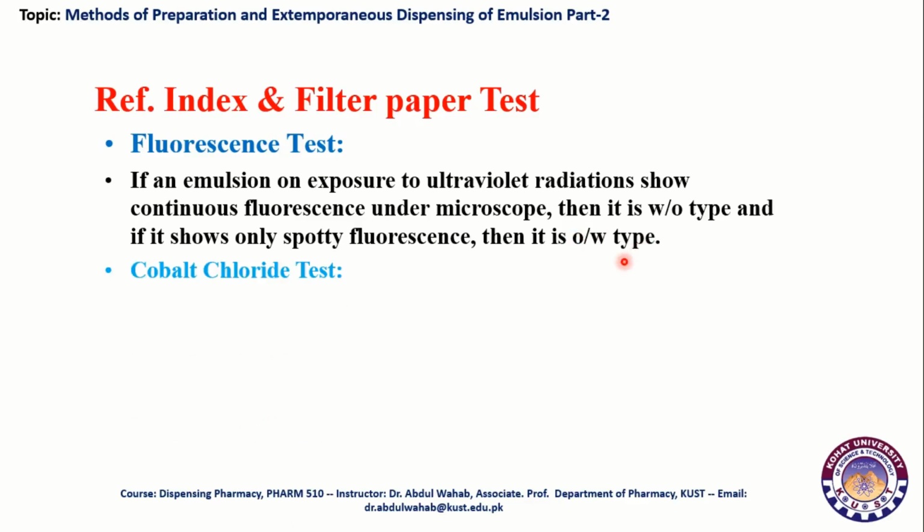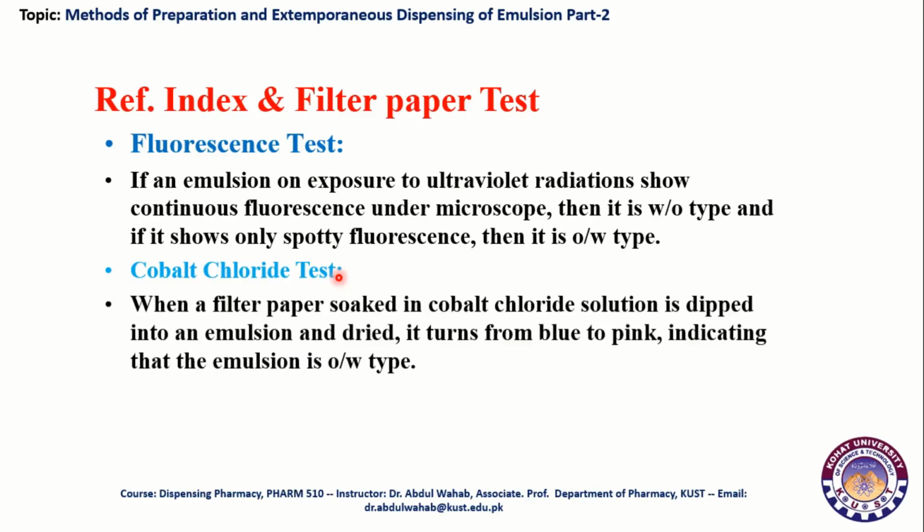Understand? Similarly, the cobalt chloride test, which is also used for the identification of emulsion. When a filter paper soaked in cobalt chloride solution is dipped into an emulsion and dried, it turns from blue to pink, indicating that the emulsion is oil in water type.